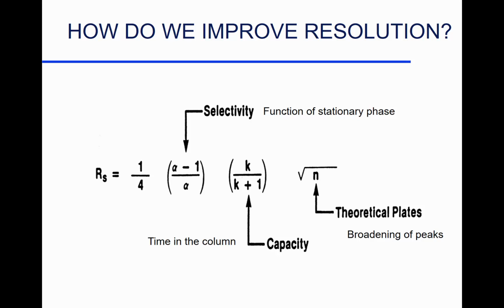But the better we can separate them, the faster I can run them, the more I can push them together, I can save time. I'm out to get my best separation, absolutely the best separation I can in the shortest amount of time. And so we work with this idea of resolution. Let's make it good. Let's make it great so I can have quick analysis. I can take maybe an hour analysis and make it run in 9 minutes. Guess what? I can do 10 times as much. So this is what we work with.